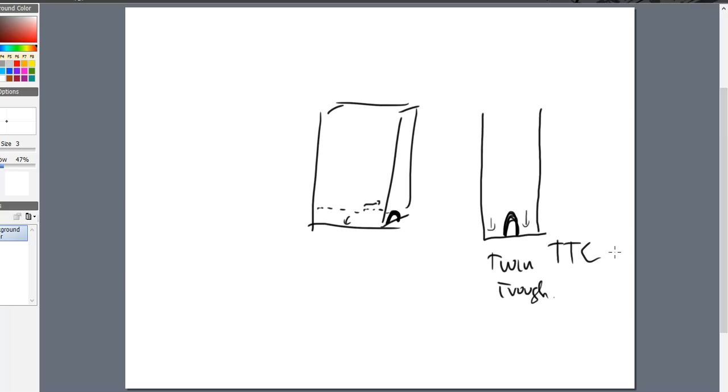All right, so when I place the plate in here, most of the time, if I hand develop a tank, I choose the back well. The reason is that I'm going to lean the front part of the plate up against that area, and I rest the back of the plate against the glass of the chamber.